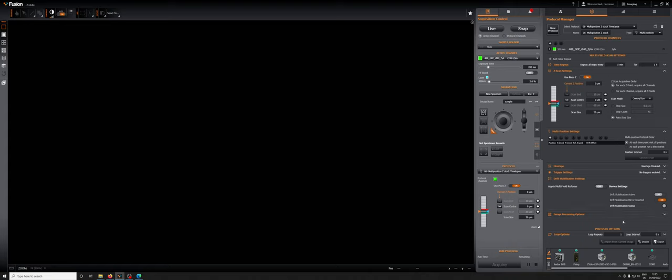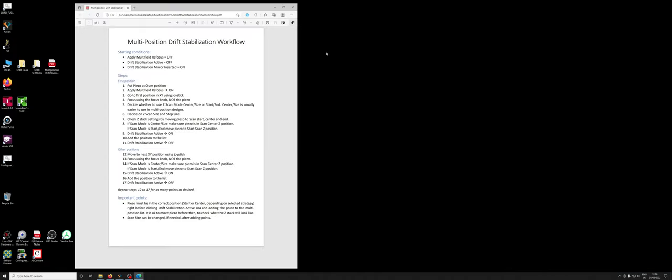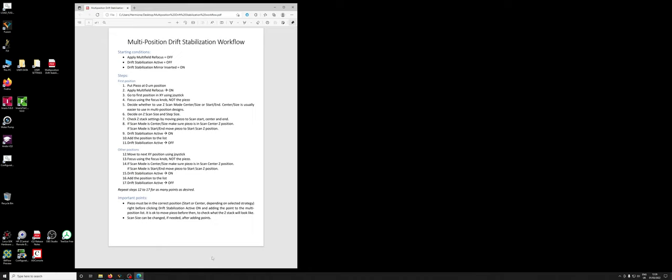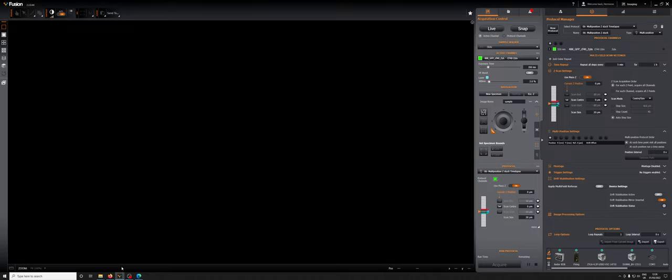When we add new positions and we want them to be stabilized for drift, there is a very specific order and very specific steps that need to be undertaken. These steps will be in a sheet that will be in the imaging room at all times. They are also in this PDF on the desktop which is open here. I recommend if you're looking at this video you can print this out and follow along as I do them.